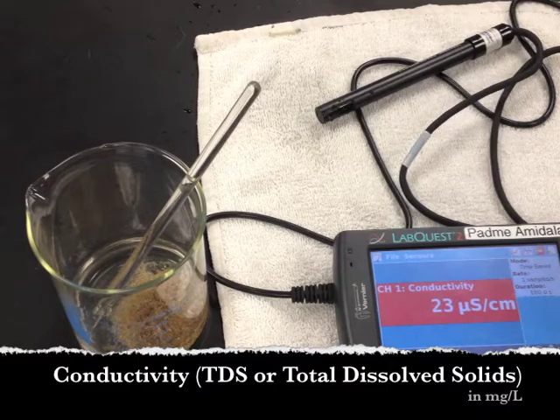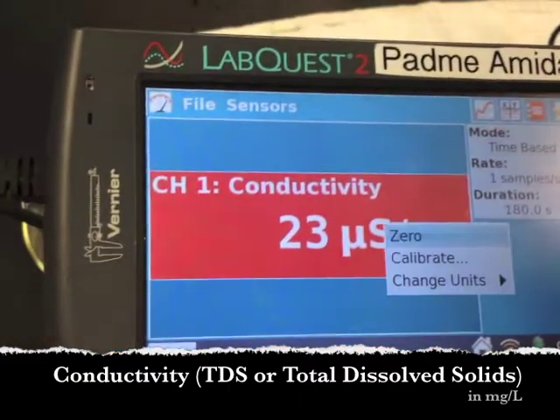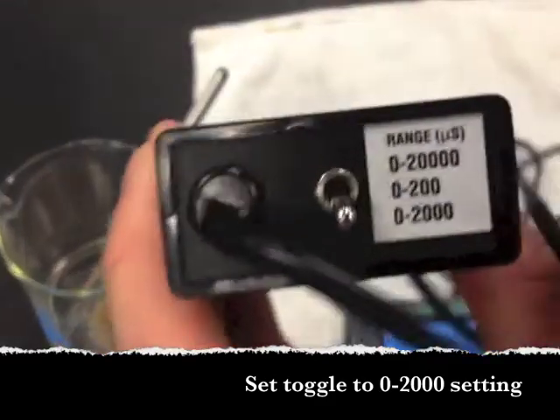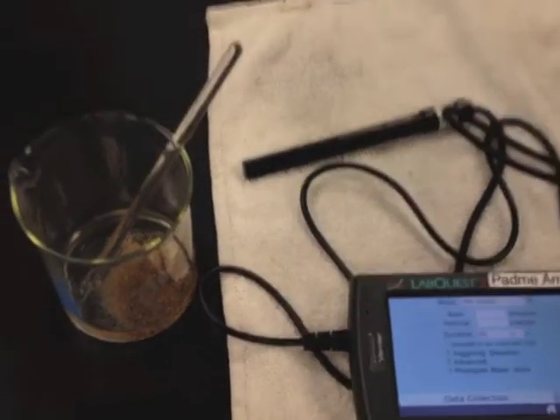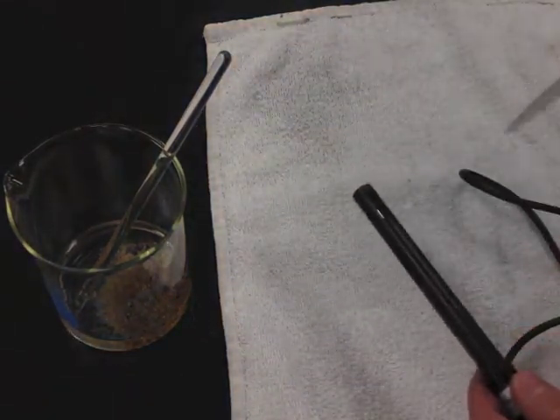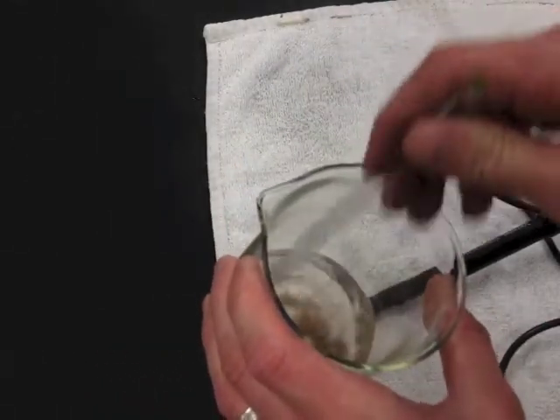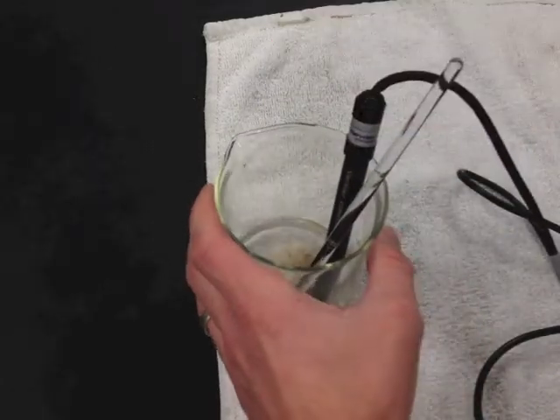The easiest test is doing the conductivity for the total dissolved solids, so let's do that first. Change your units to milligrams per liter. Set your toggle switch to the 0 to 2000 range — the middle range. Then rinse off your conductivity probe with distilled water, and simply put it in the water sample. Every time before you take a reading, make sure to mix the water first.